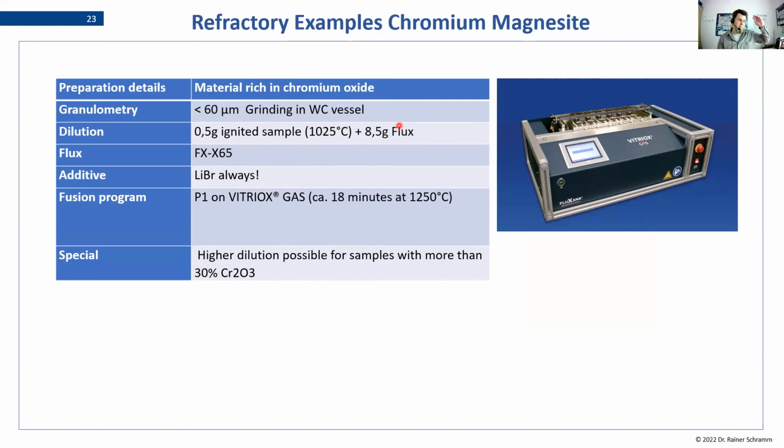The beads will simply break once they solidify and cool down. And as additive, we use lithium bromide here all the time. Every bead we make gets its share of lithium bromide. Again, the reason here being the chrome oxide, it just simply doesn't work without.